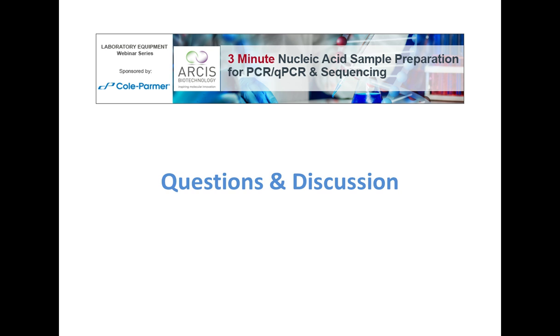One more for you, Paul. Are there any restrictions due to the size of nucleic acid? No. I mean, you need to bear in mind that the kit will fragment DNA. So if you're looking for massive reads, for example, if you were using a PacBio next-gen sequencing machine and you needed 30 kb stretches of DNA, this might not be the right tool for the job. But in terms of restriction on nucleic acid length, no, not really. It'll suit 99% of applications.